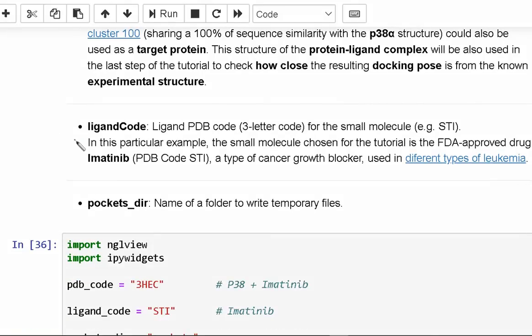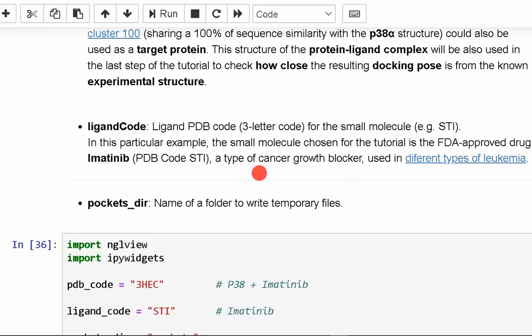The second parameter is the ligand code for the small molecule. In this particular example, the small molecule chosen for the tutorial is the FDA-approved drug imatinib. The PDB code of imatinib is STI. Imatinib is a type of cancer growth blocker used in different types of leukemia.